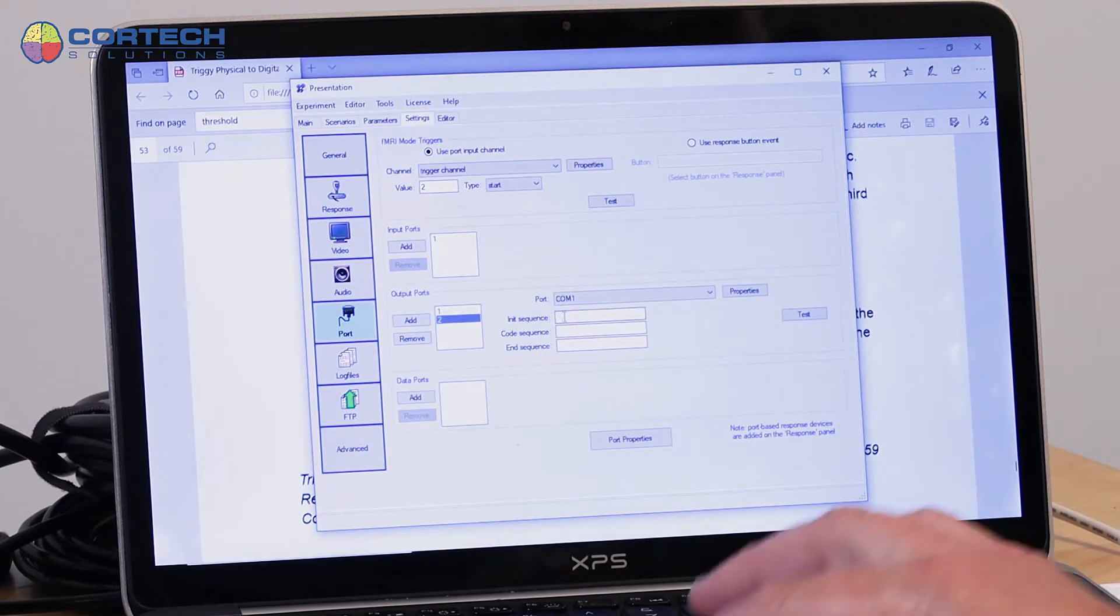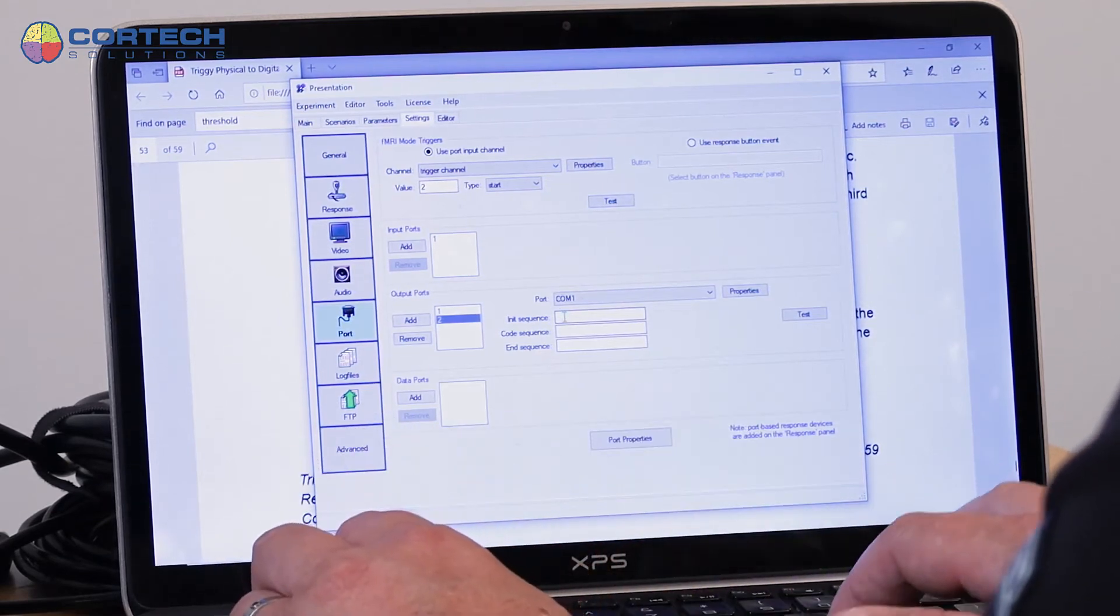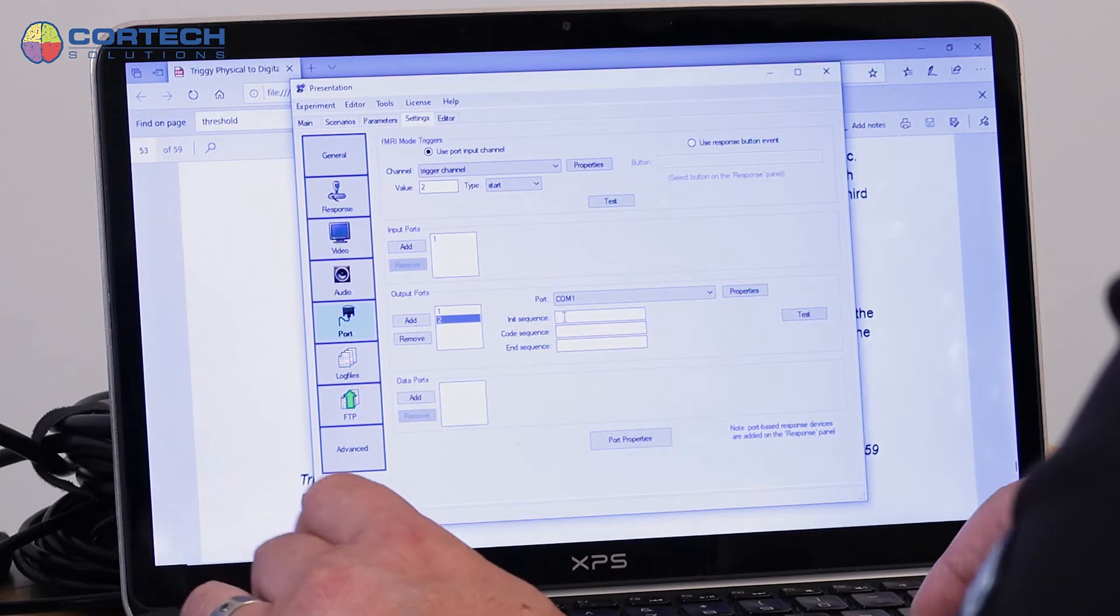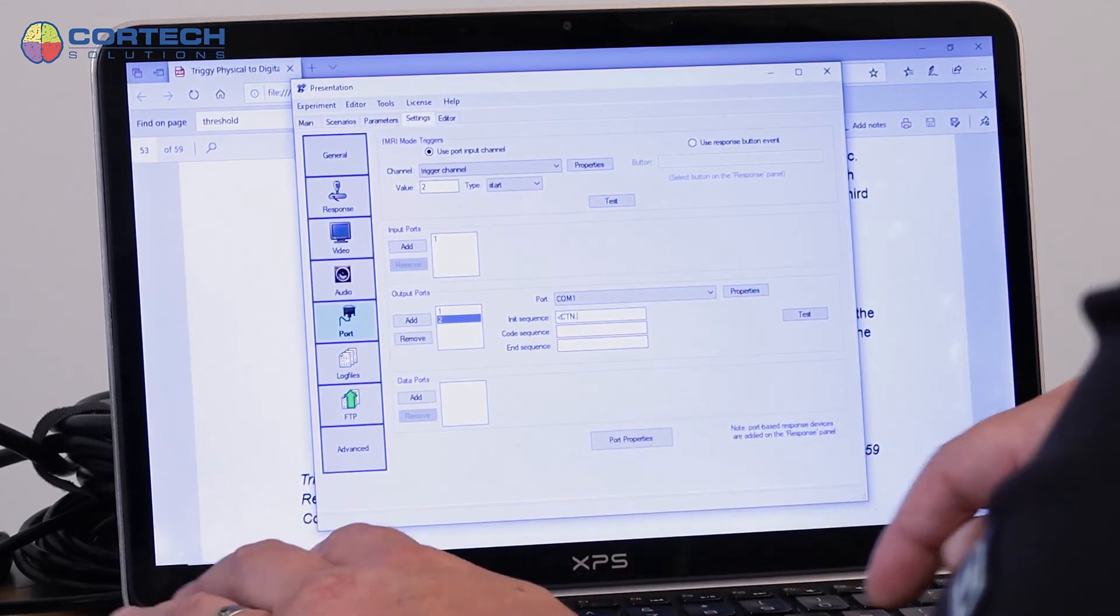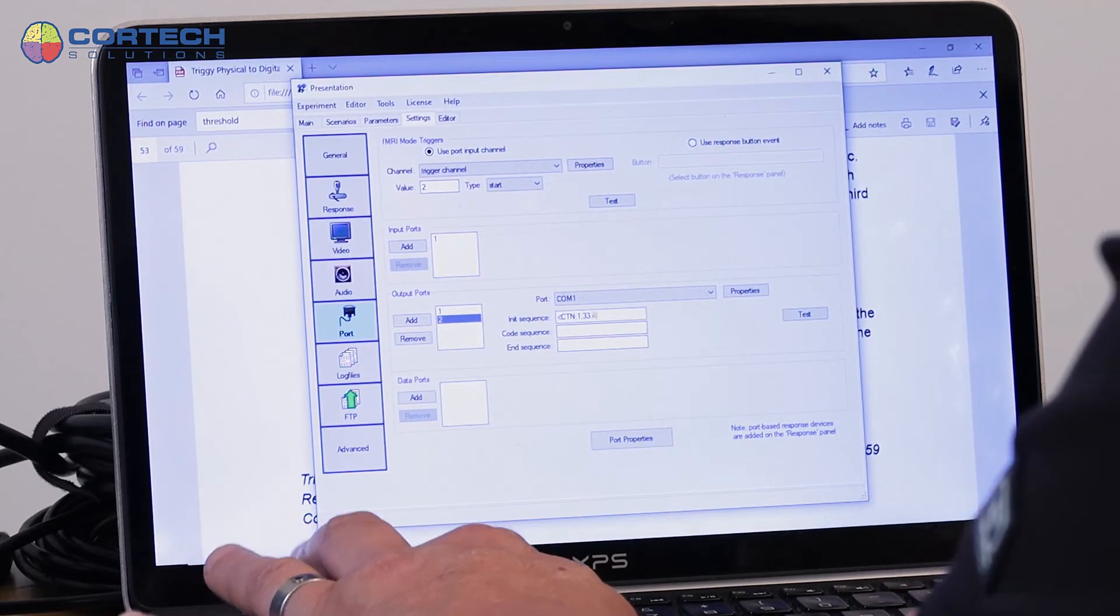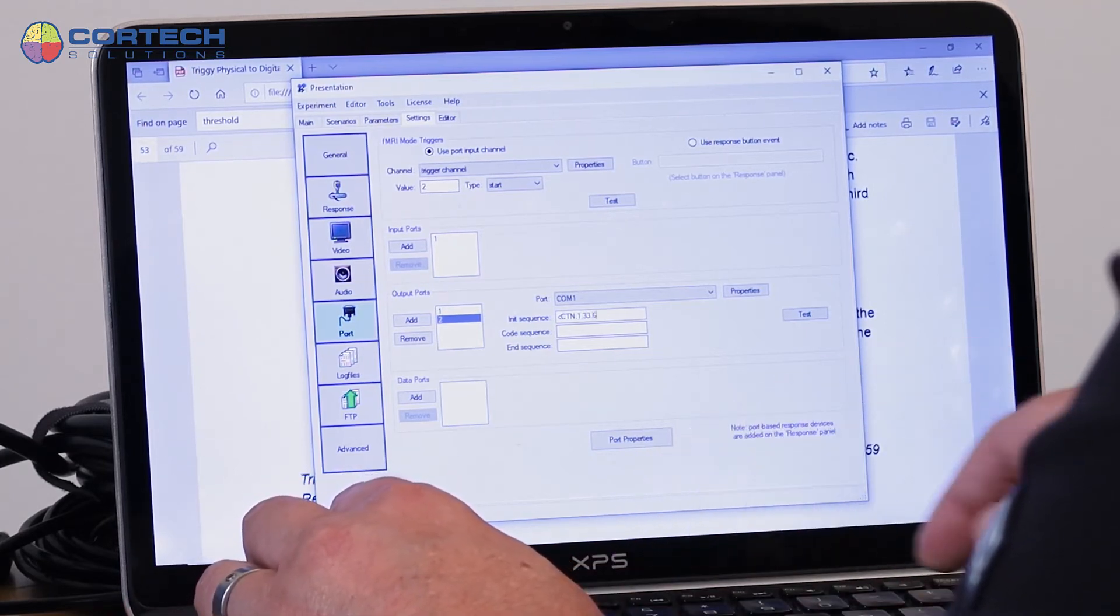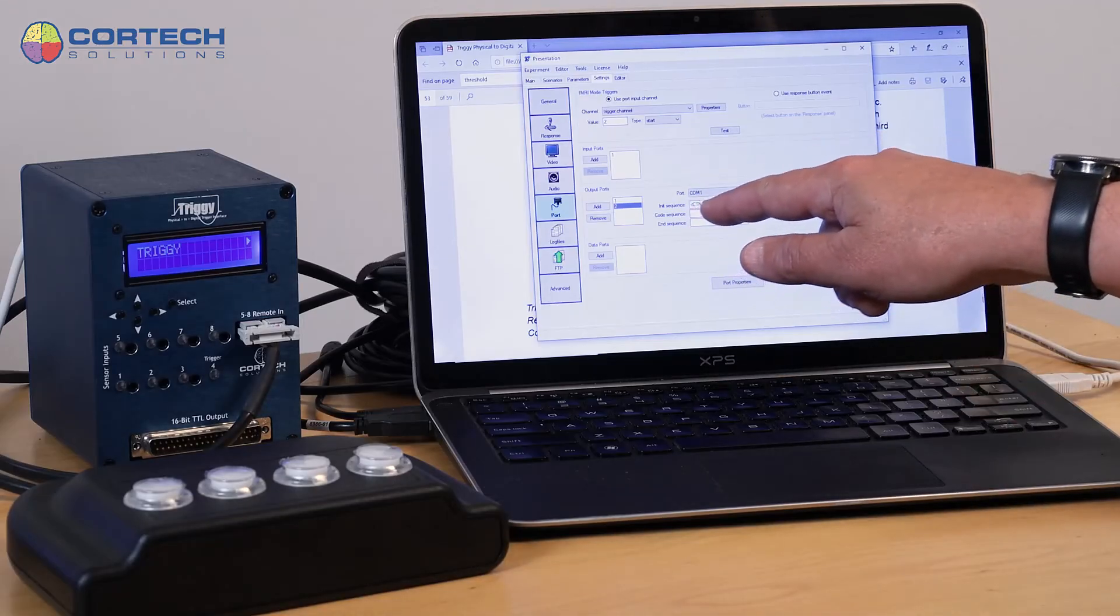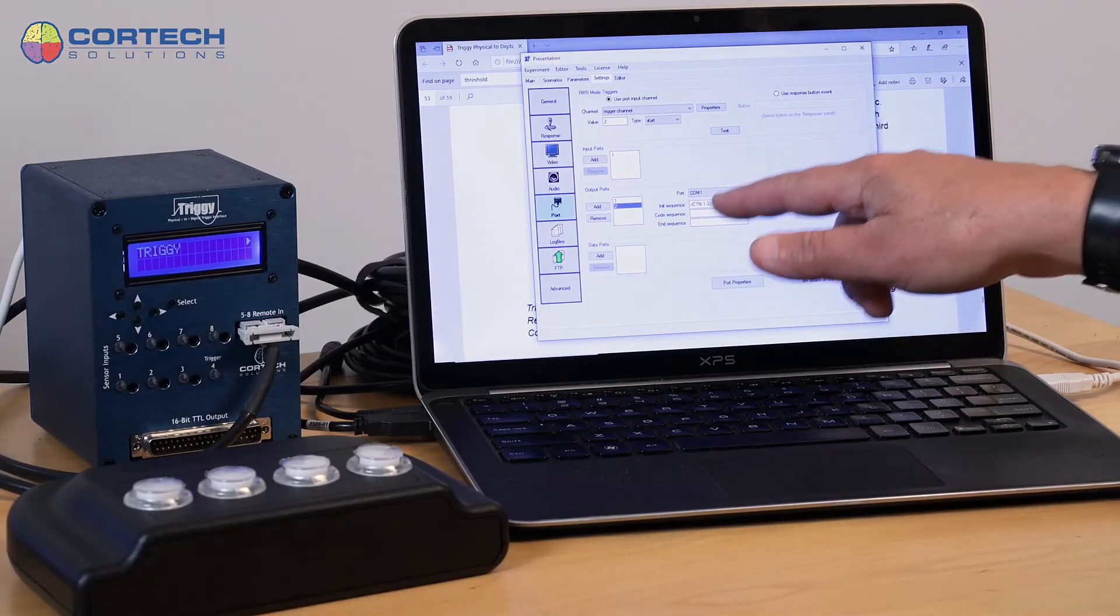So that same sort of command string, CTN comma 1 comma 33.4 or 33.6, could be entered here as an initialization sequence, so that when the experiment begins, it sends that to Triggy.